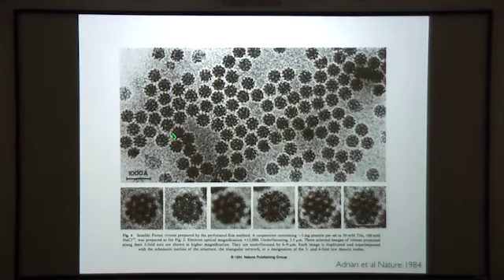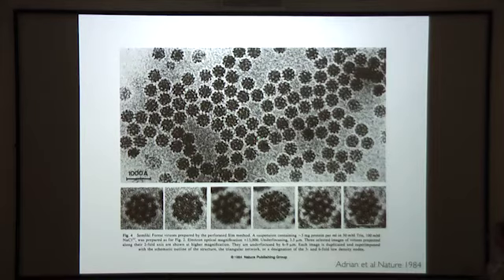These are some of the first images of a biological specimen in vitreous ice. This is the Semliki Forest virus, and it's really beautiful how you can see all the features of these viruses, and this is from 1984.